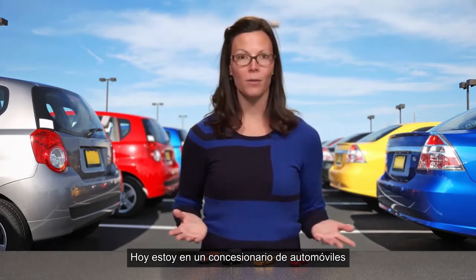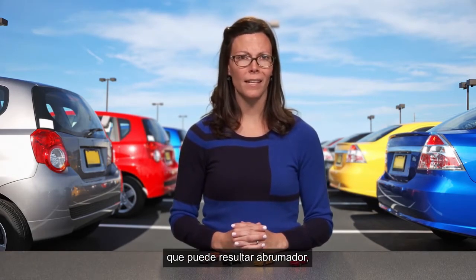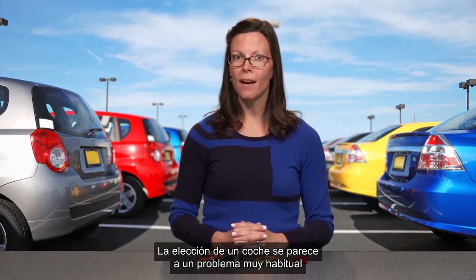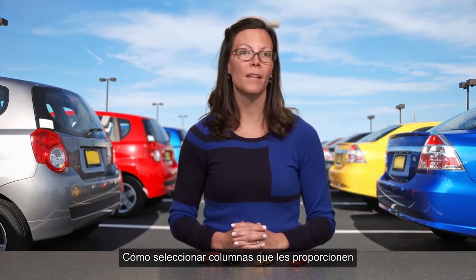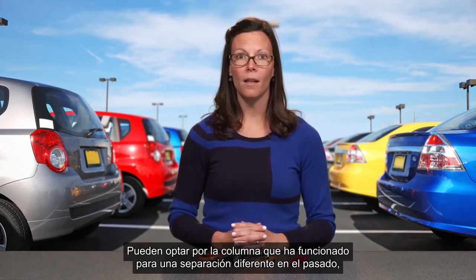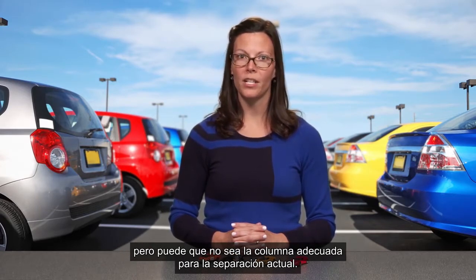Today, I'm at the auto dealership, and I'm looking to make a very important decision, choosing my next vehicle. There are so many different features for each vehicle. It can be overwhelming, but you have to think it through. Choosing a car is similar to a common problem that separation scientists face every day: how to select columns that will give them the best chance of separating their sample. They could go with a column that has worked for a different separation in the past, but that may not be the right column for their current separation.